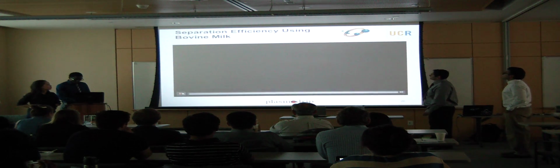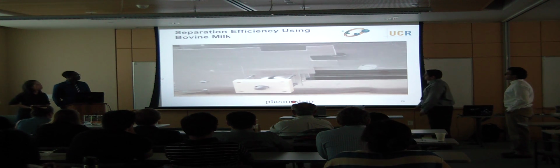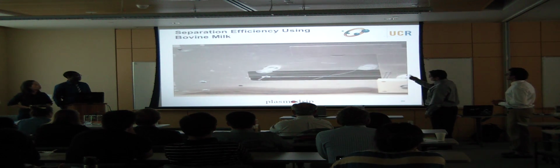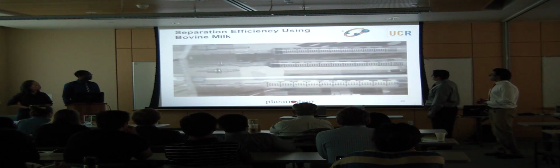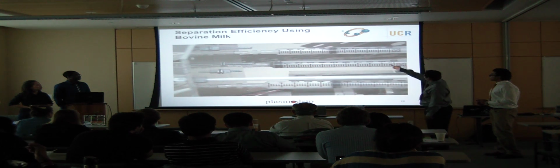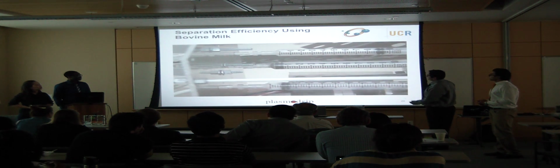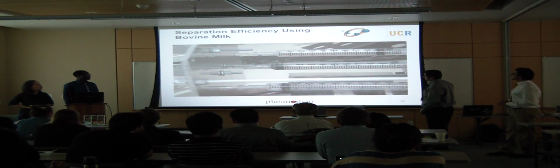Here's a short video, a sped up version, since ours takes a while. There you see the first syringe being pushed in, it moves to the second position, and pushes that one. This process will happen multiple times in order to accumulate our sample in here. Here we have an inside view. We have milk going into here, and over there the other syringe being pushed out, and the filtrate slowly being collected here. It takes a while, but you'll slowly see the syringe plungers move back as we collect that sample.